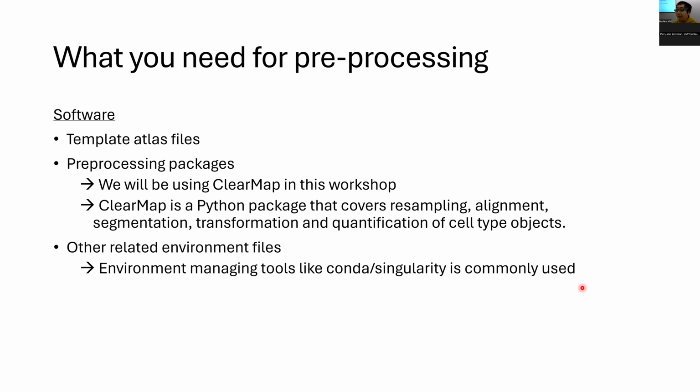The other thing is related environment files, which is something that we will typically install on a computer or set up your computer so that the pre-processing package will work. If you are familiar with Conda, those virtual environment things, that's what I'm referring to. So you also need that kind of environment so that your key package will be working.